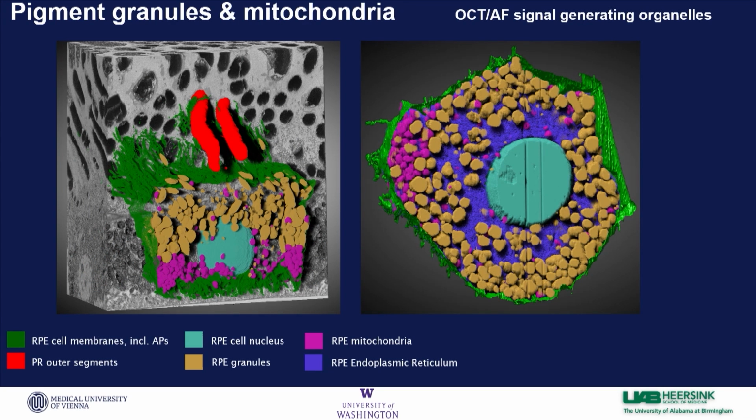And here's another image from that crop, and you can really see the polarization of the cell. These orange-brownish things are called pigment granules, and they generate a signal when you do OCT scans, which many of you have probably had routinely done in eye clinics. This is what shows reflectance, and we wanted to analyze their volume and visualize them because they're very important for this clinical imaging.